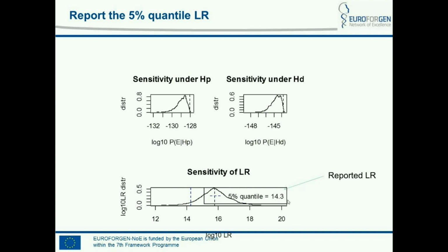So in the next talk, I'm going to carry out a comparison with EuroForMix Studio, and I'm also going to make the model more complicated to show you some of the interesting properties.